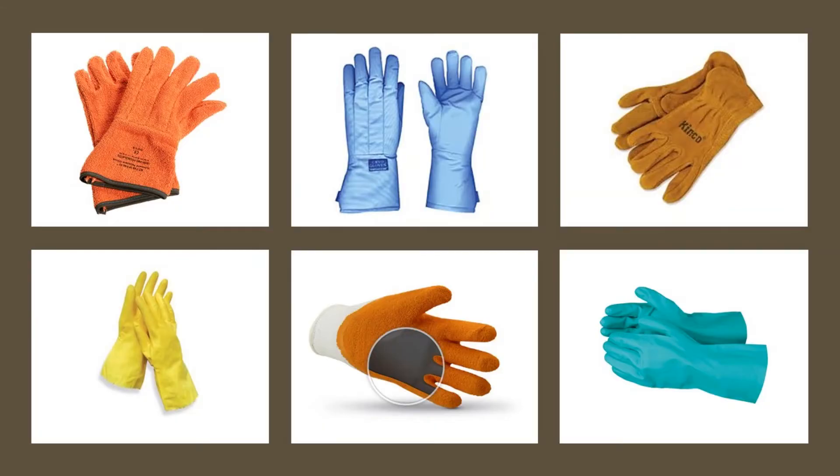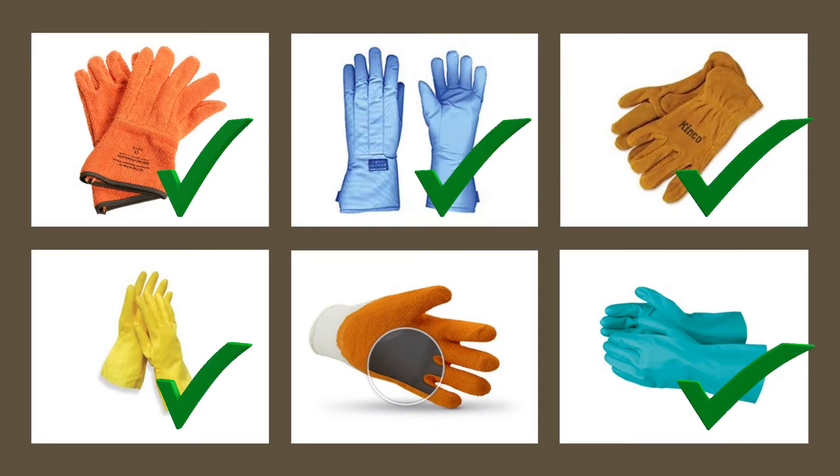Also remember specialized hand protection like thermal protective gloves, cryo protective gloves, work gloves, rubber gloves, and sharp resistant gloves. Make sure you choose what protects you the best.